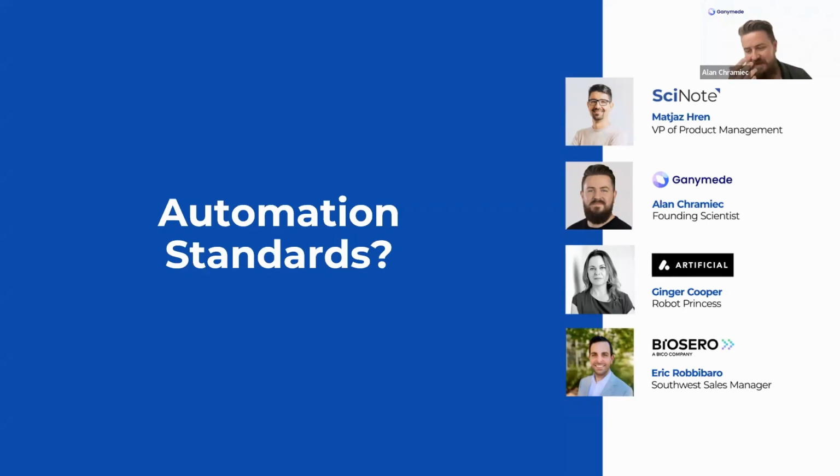Yeah, I mean, we don't rely on, we can incorporate some of these standards like Allotrope and other ontologies coming through. We're open enough to incorporate them, but we don't impose one file type, say, on all the data that we're saving. So we see everything as data frames, take all the data from all these different instruments, parse them out and put them into structured tables that are open-ended enough that you can then integrate however you need. So the level of standardization that we're focusing on. Right. Good point.